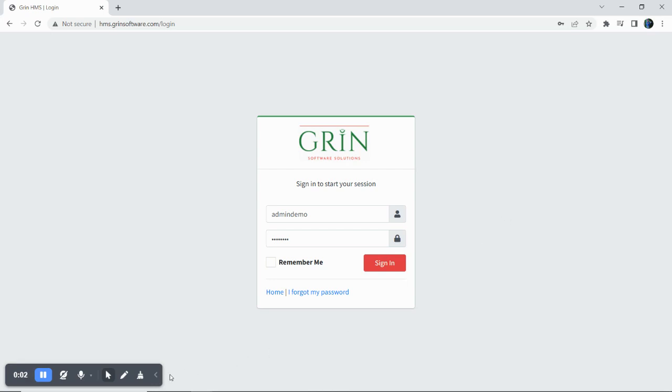Welcome to Grin Software. In this video, I am going to explain our clinical test software.